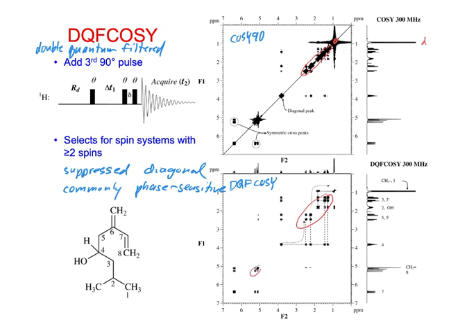We can even see in here as well. So if you have a complicated spectrum with a lot of peaks close to the diagonal, which means you have peaks that are close together and coupling, so the off-diagonal peaks that show the coupling are narrow in on the diagonal, then this can be a good experiment for that.